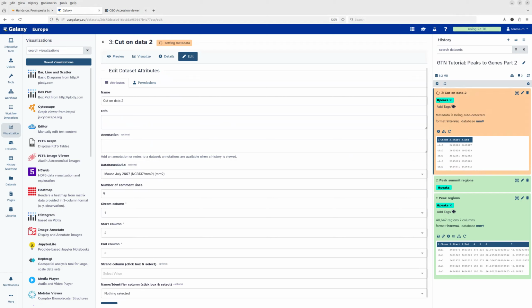However, we can proceed because as a next step, we actually need also our gene names file again. And if you remember, I cheated before a little bit by telling you we want to have the gene names, but what we actually had was the RefSeq IDs. If you remember, the names were called NM and then underscore a number. So we did not actually have the name, but the IDs.